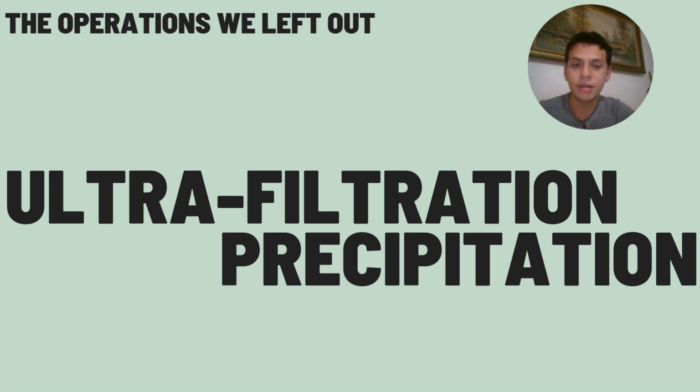On the unit operations that we left out, we have ultrafiltration, which we intended to use to separate the smaller biomolecules from the solution, for example, proteins, etc. And we didn't use it because in the lab, when we tried to do it on an ultrafiltration unit in the centrifuge, the filter got clogged up. Only a little bit of the liquid got past the membrane.